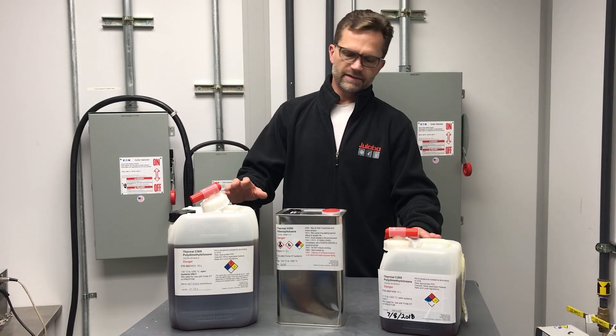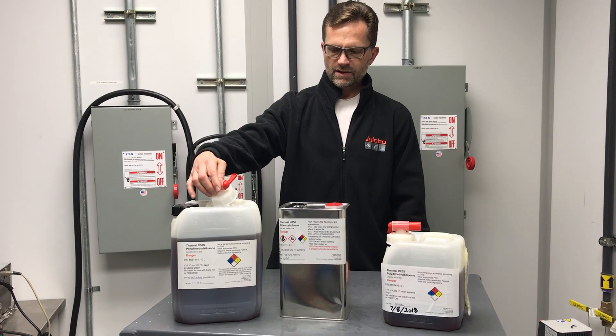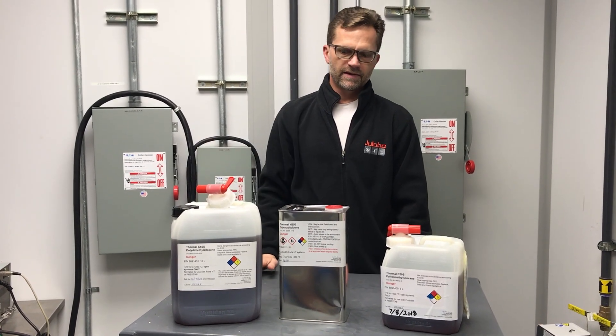They come in five and ten liter containers with an easy pour spout that you can install. In addition, we offer them in 55-gallon drums.